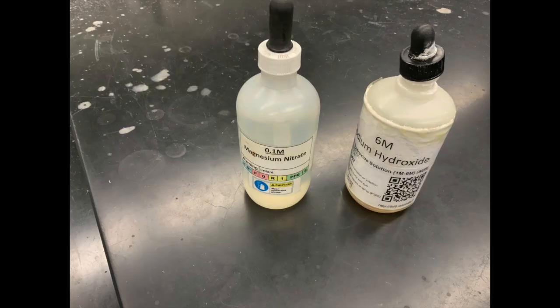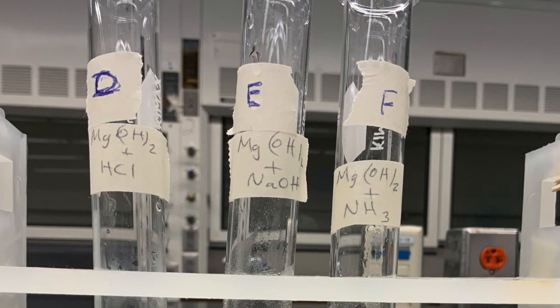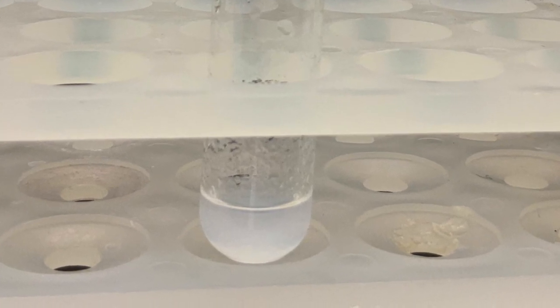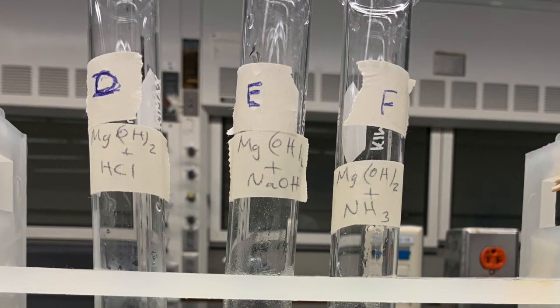Now we are going to repeat the experiment, but by mixing magnesium nitrate and 6 molar NaOH in 3 new test tubes labeled D, E, and F. Just like before, this is what we observed in the test tube at the start. Now we are going to arrange the 3 test tubes from left to right.